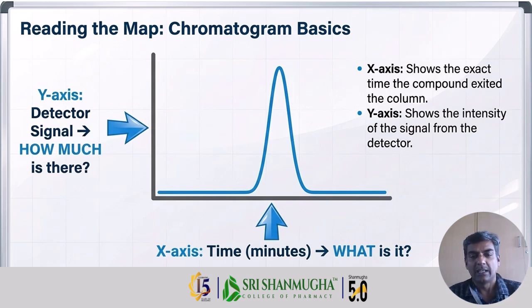So to understand the chromatogram, we want to see this slide, reading the map: chromatogram basics. Think of a chromatogram like a map that gives us complete information about what is happening inside the HPLC system. Now let's break this map into two simple parts.